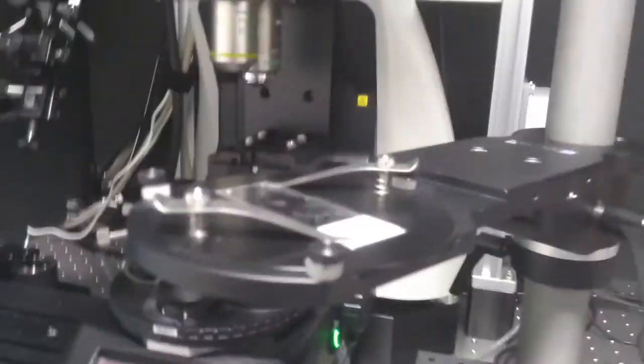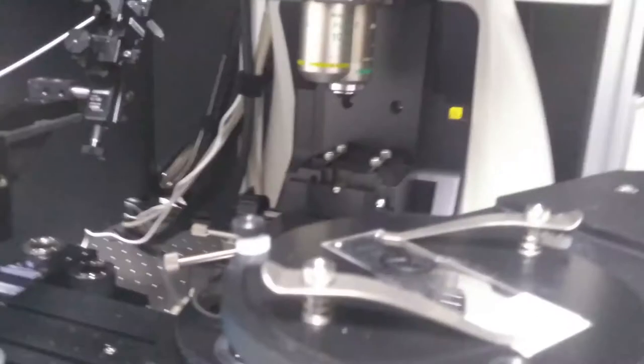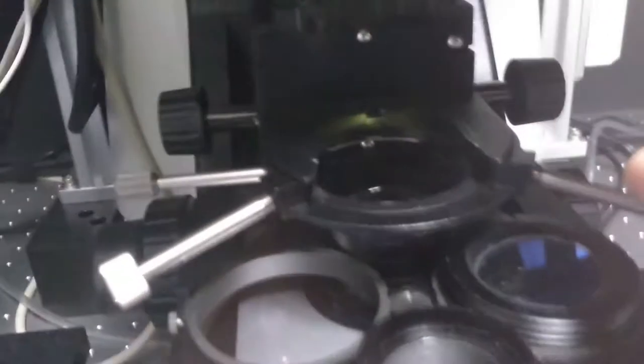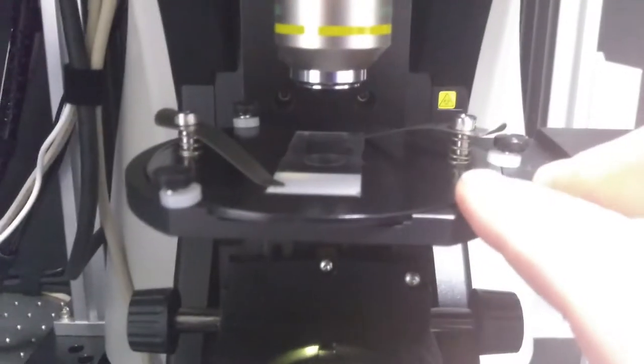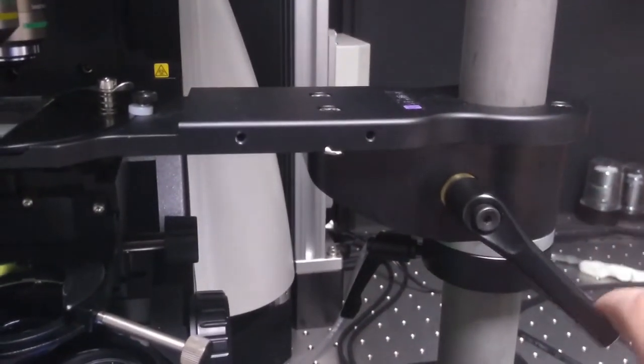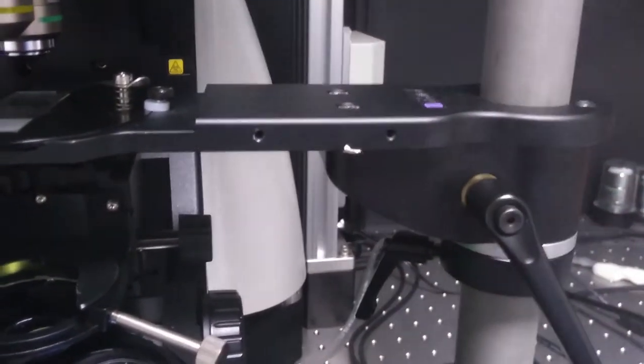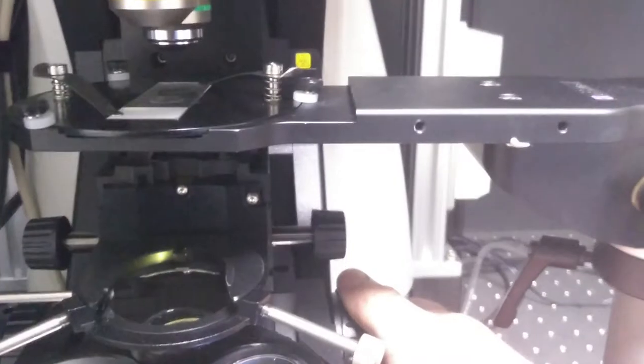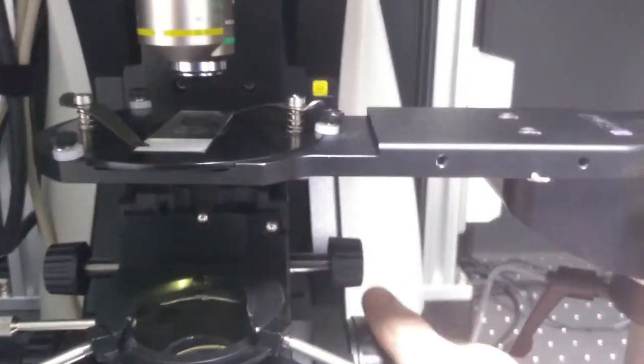Once you have loosened the arm, you can then carefully check that the lenses are not lower than they should be and swing your slide into place like this. Then you can tighten the arm up again with hand pressure and you will be able to adjust focus and focus on your sample.